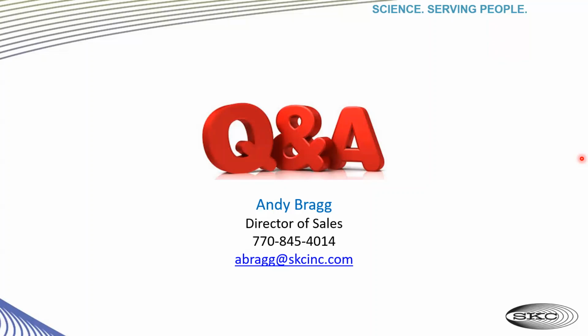Okay, might be able to squeeze in this one too. Is there an expiration date on the PPI? Yeah, that's a good one. We have the expiration date set at 18 months from manufacturing. And Saulius, do you want to elaborate on why we set that period of time?